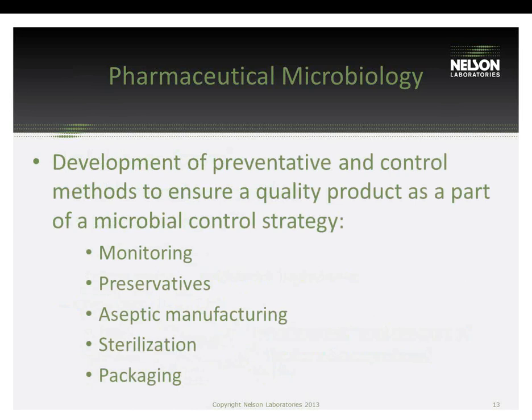Through the regulations and learning how non-sterile products affect the users, there was a development of methods to ensure quality products and microbial control during manufacturing.